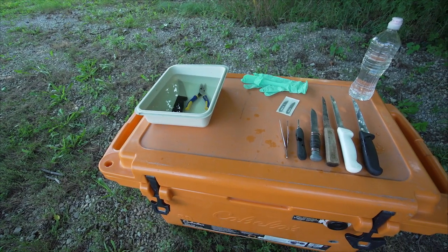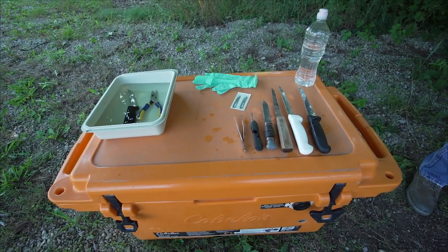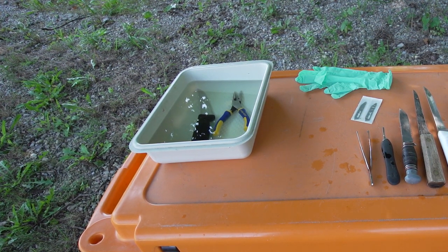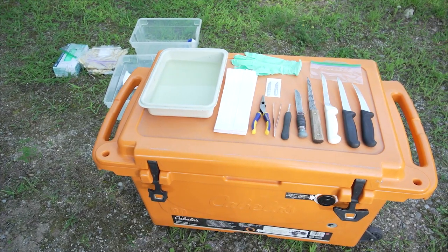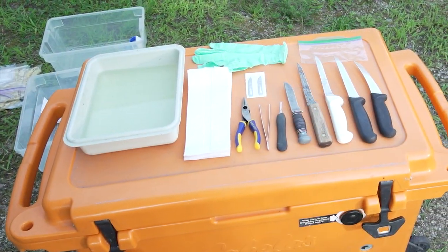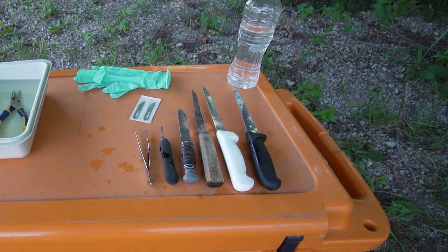Once you clean off the tools, let them soak for 10 minutes in a 50-50 household bleach solution. To mix this solution, mix equal parts of bleach and water in a container. This is a caustic and concentrated mixture, so please be sure to work in a well-ventilated area and wear protective clothing and eyewear to minimize any contact with the solution. You should make a fresh bleach solution daily and avoid soaking tools much longer than the recommended time.